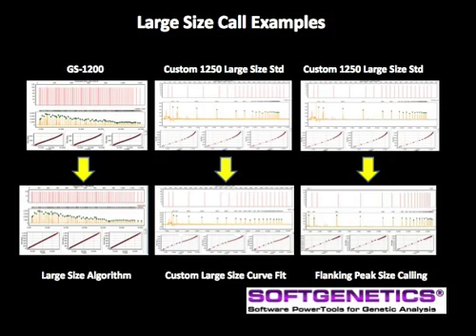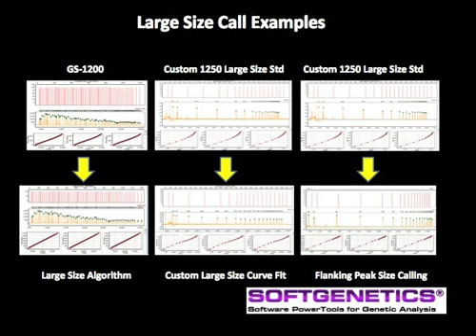We will use some examples to illustrate the benefits of selecting a size calling algorithm that is best suited for different large size standards. The upper figures are large size internal lane standards that were analyzed using the Local Southern method, each having data that deviates from the linear range. The lower figures are the same size standards but analyzed with unique GeneMarker size calling algorithms, showing improved linear range. At the left, the large size algorithm provides linear range for all of the fragments in GeneScan 1200. The custom large size curve fit method in the center provides an improvement in linear range for a custom large size standard that has most fragments concentrated in the upper size range. The flanking peak size calling at the far right provides linear range for this custom size standard.